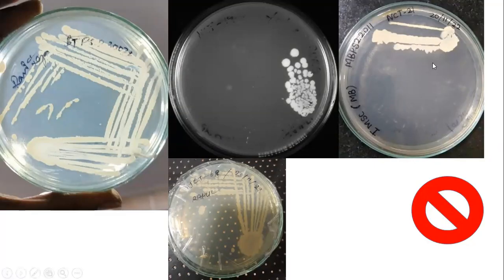What has happened here is, the loop is hot. Very simple explanation. The loop is very hot. That's why there is no growth in the second quadrant. Here, I would say the candidate did not have a consistent strategy. Here he has used the last three lines, but here he has lost his focus. In making the fourth quadrant, he has touched the mother lawn. That's why there is no isolated growth. He was supposed to get isolated colonies here, but because he has somehow touched the mother lawn, again there is continuous growth as a result. Do not document something like this, putting it in the chair or something; take a picture.